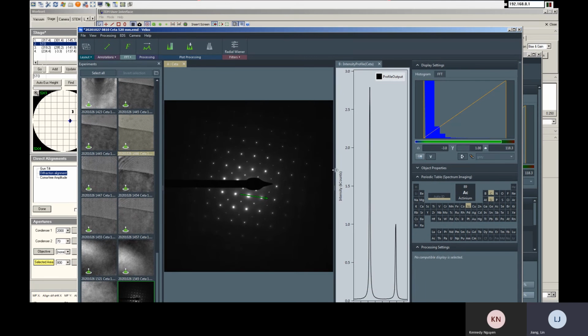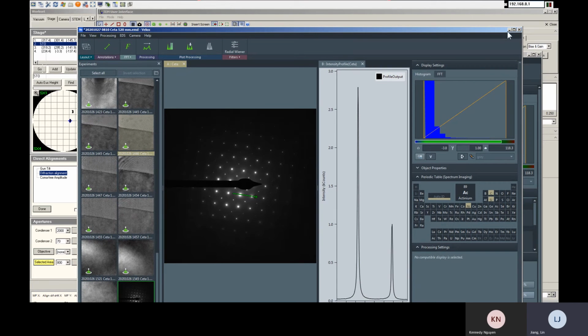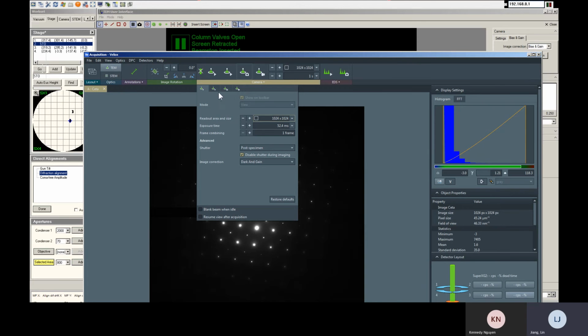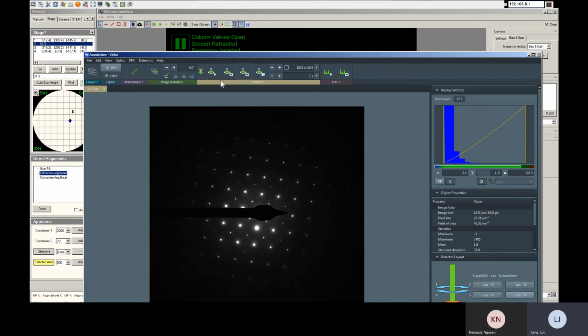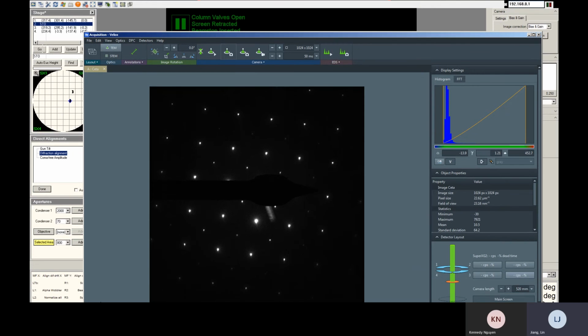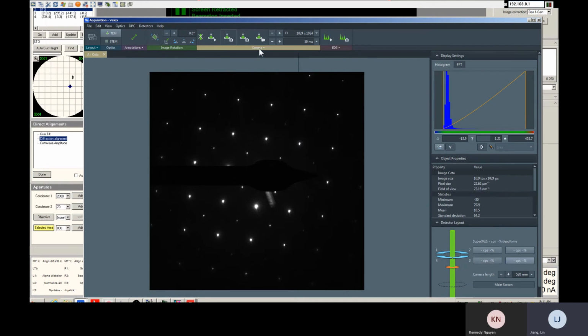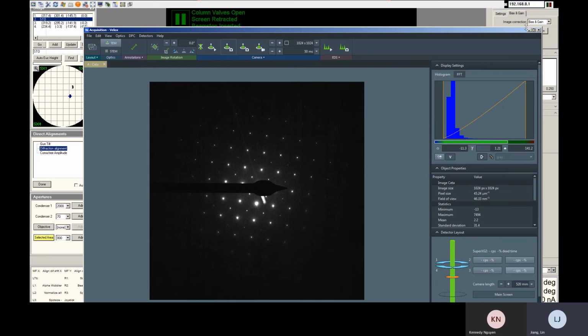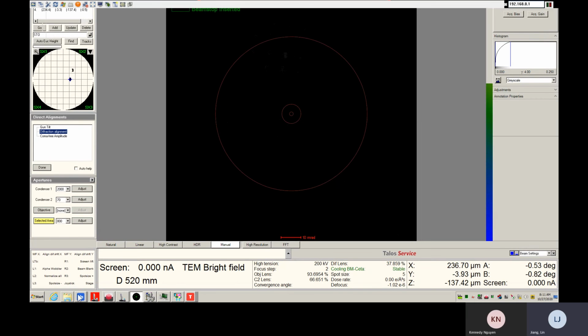So you want to make sure your image is safe. Another thing, you can just use one frame. You can go here and set up a quick acquire. You can go small design, and you can just acquire a single frame image, and then you can take a look. This is enough for this one, the corner image. And then you take a look at your data processing.